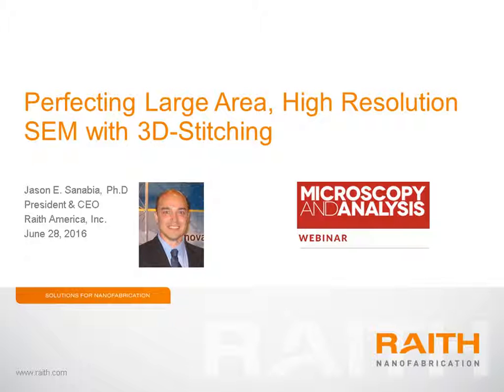This technology combines the resolution and flexibility of the SEM with the accuracy, stability, and automation of the electron beam lithography instrument. With high-resolution SEM, several electron detectors, laser interferometer stage positioning, and field of view mapping, the chip scanner produces accurate large-area high-resolution images. Since the position of each pixel is determined by laser interferometry, these images can be 3D stitched with the highest possible accuracy.